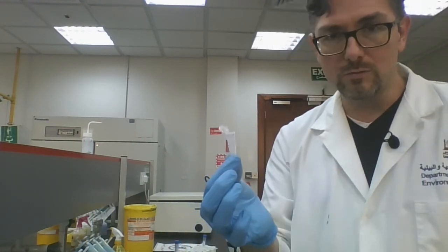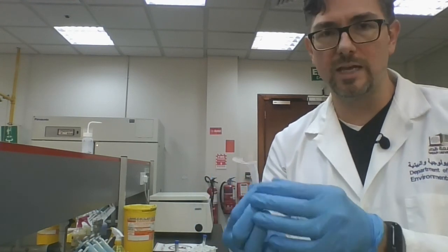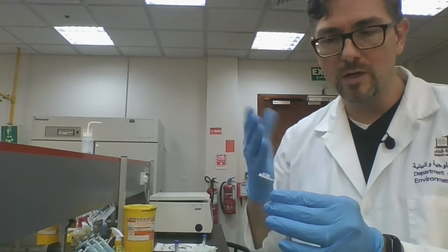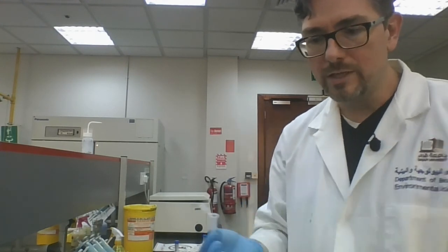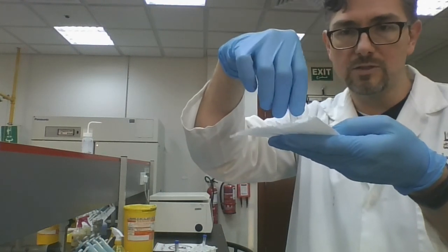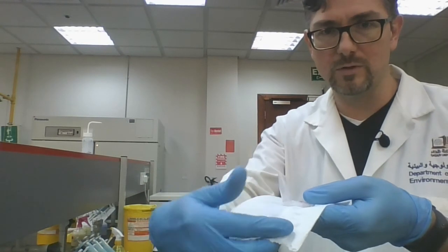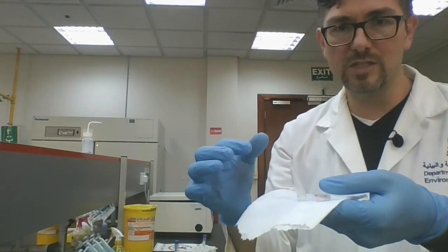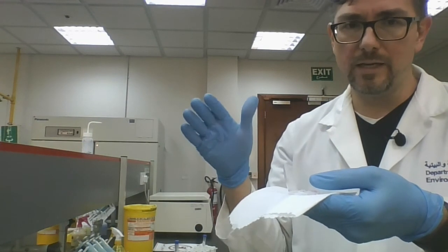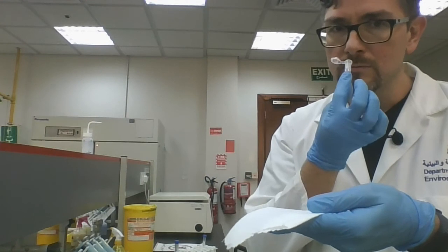So what we tend to do is leave this pellet to air dry. You can leave it either in a fume hood with the sash down so that there's air passing over the surface for about 10 minutes or so to remove any excess ethanol. Or you can just leave it on your bench in front of you, upside down so nothing falls in. You can leave it in a kind of clamshell configuration, so we can see that here. Just leave it sitting on your bench like this for about 10 minutes or so. The air is going to be passing by it, and as it does that, it's going to be removing the ethanol.